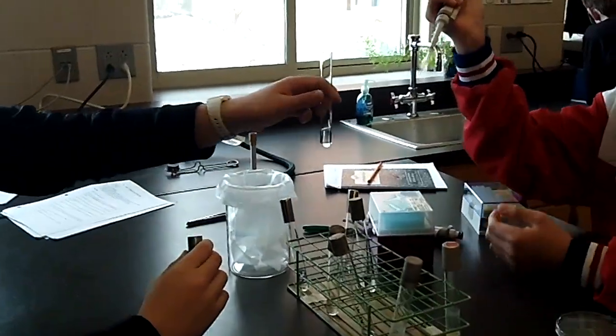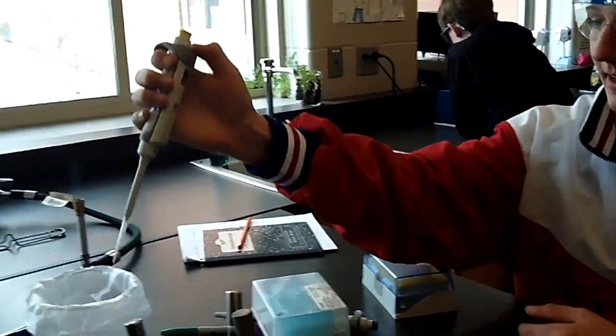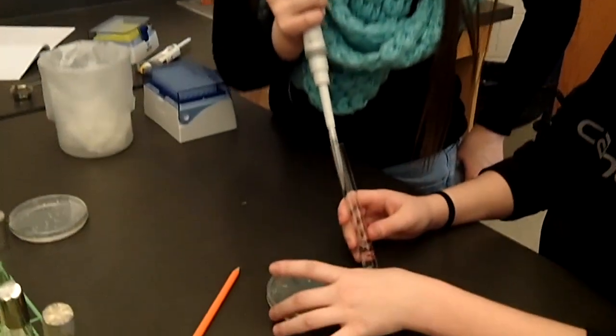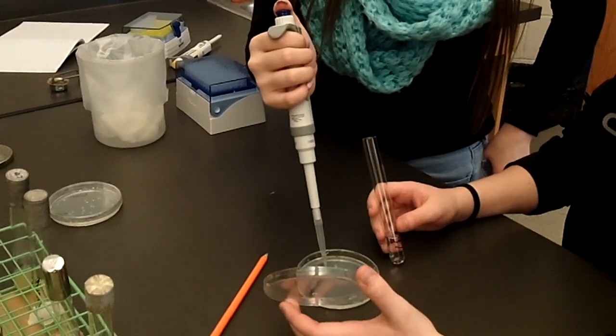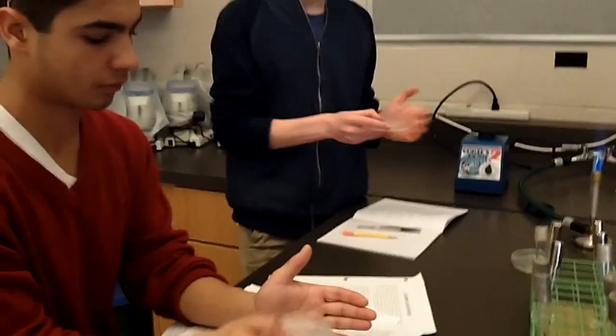This approach not only demonstrates that evolution is a tangible process that happens in real time, but also provides practical laboratory experience and knowledge of fundamental concepts in microbiology, ecology, genetics, and physiology.